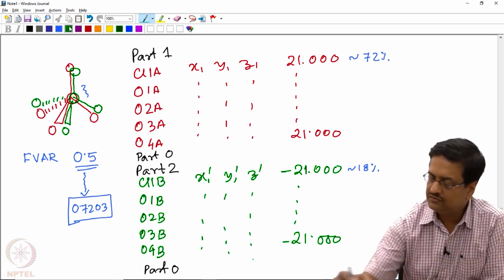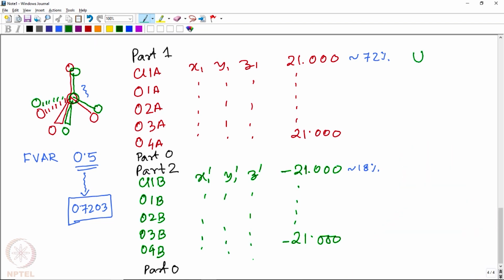And then at the end, as usual, you will have the isotropic thermal parameter for all of them, which also will be independent parameter and will be refined along with the refinement of occupancy. So once with isotropic refinement we have converged to the least square refinement convergence, then one should do anisotropic refinement and get that U iso to get converted to those 6 anisotropic thermal parameters.